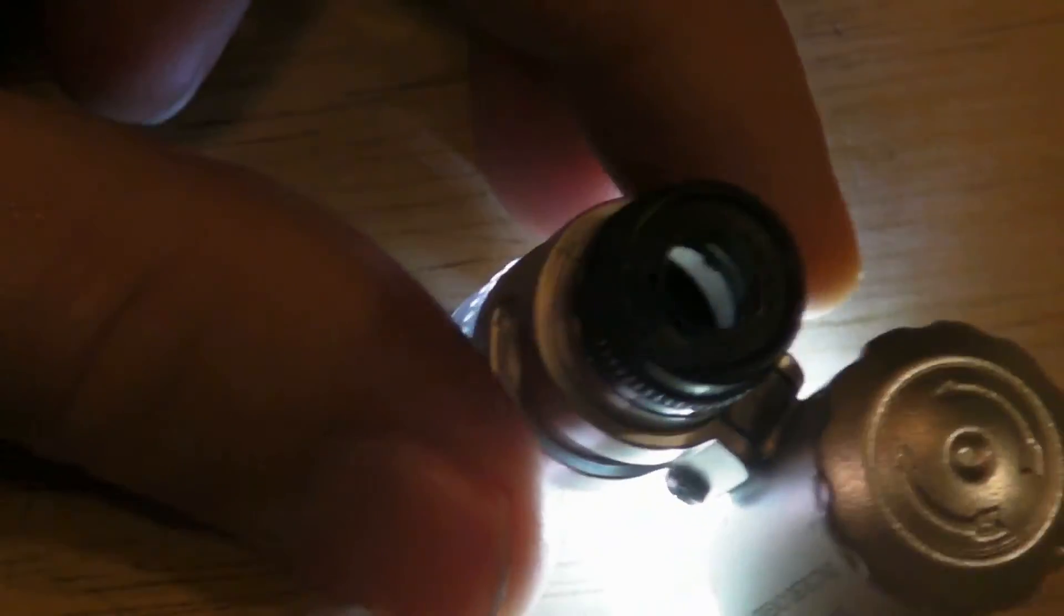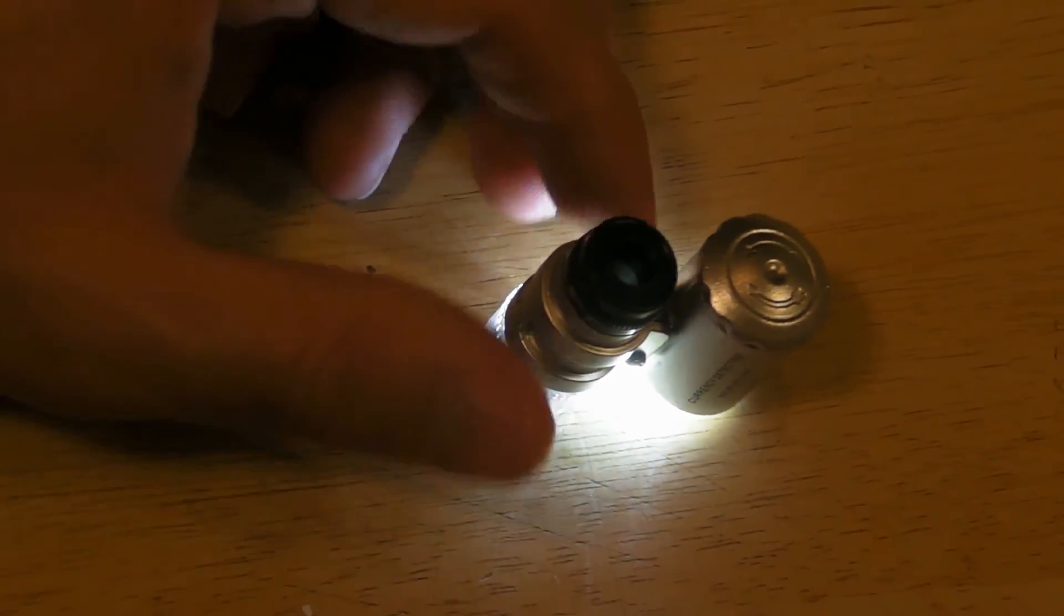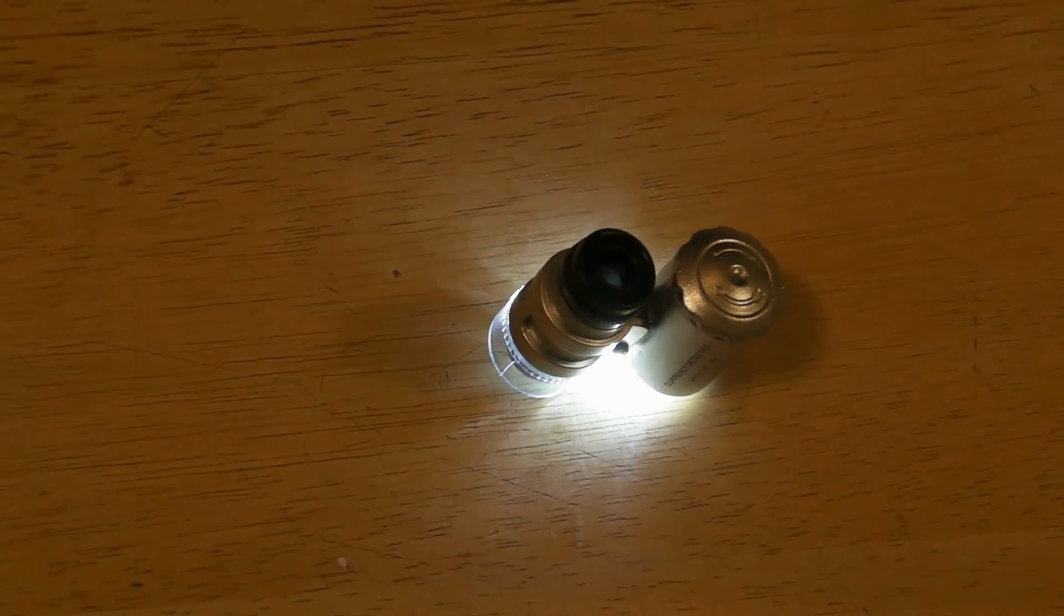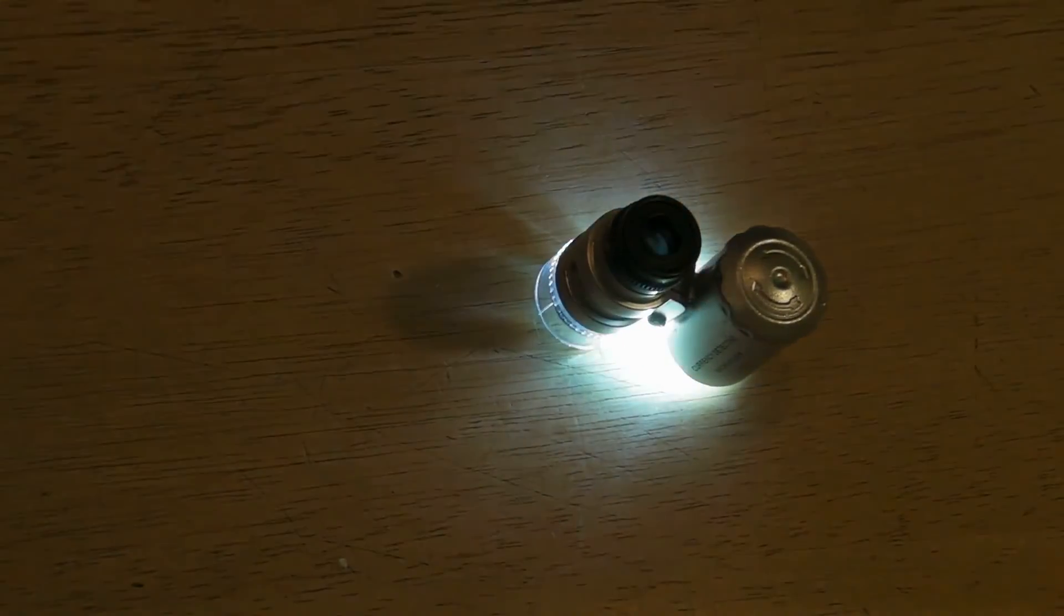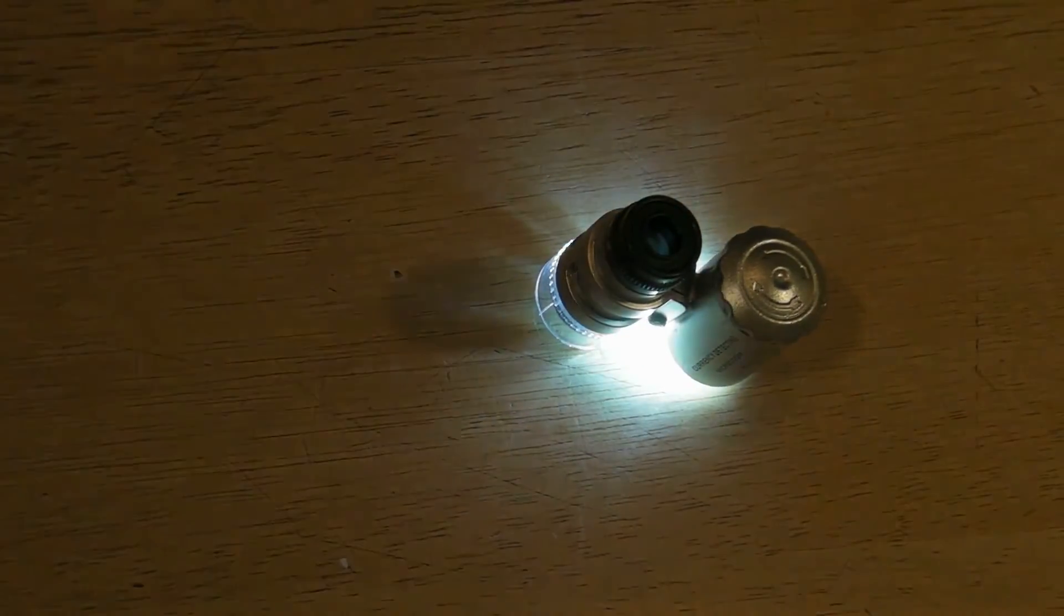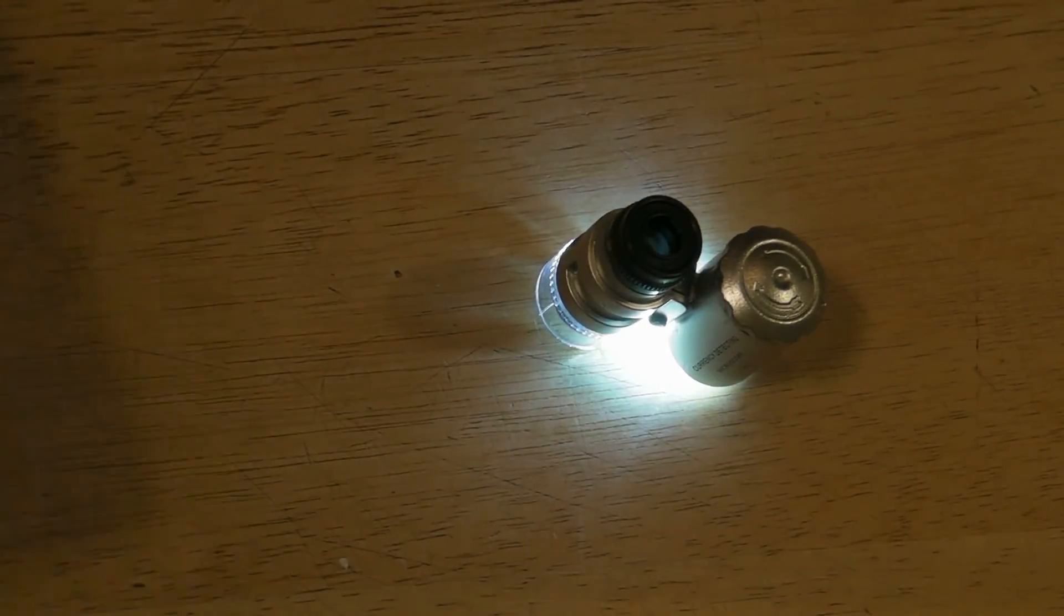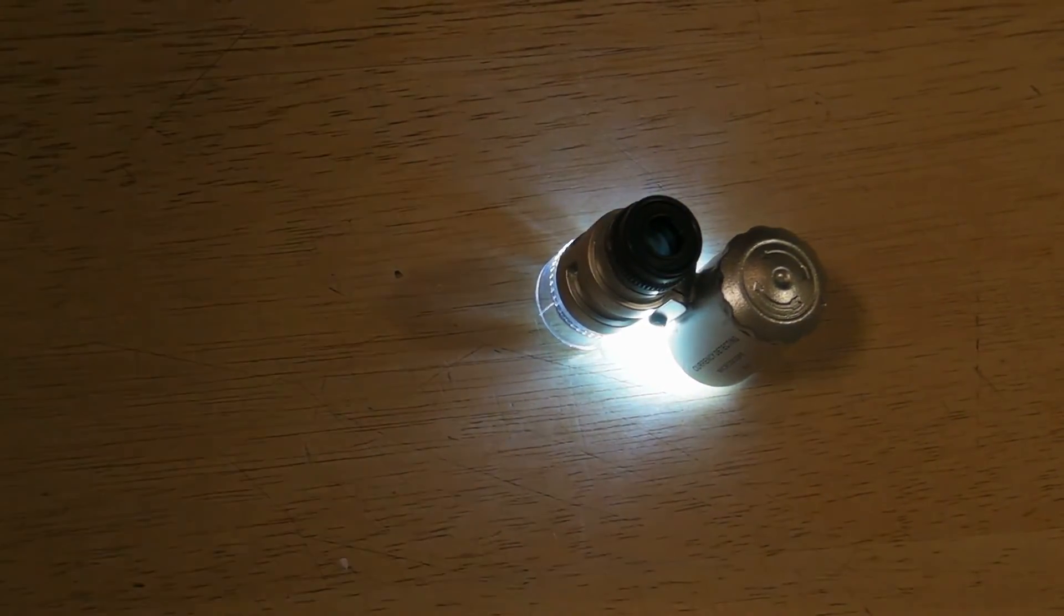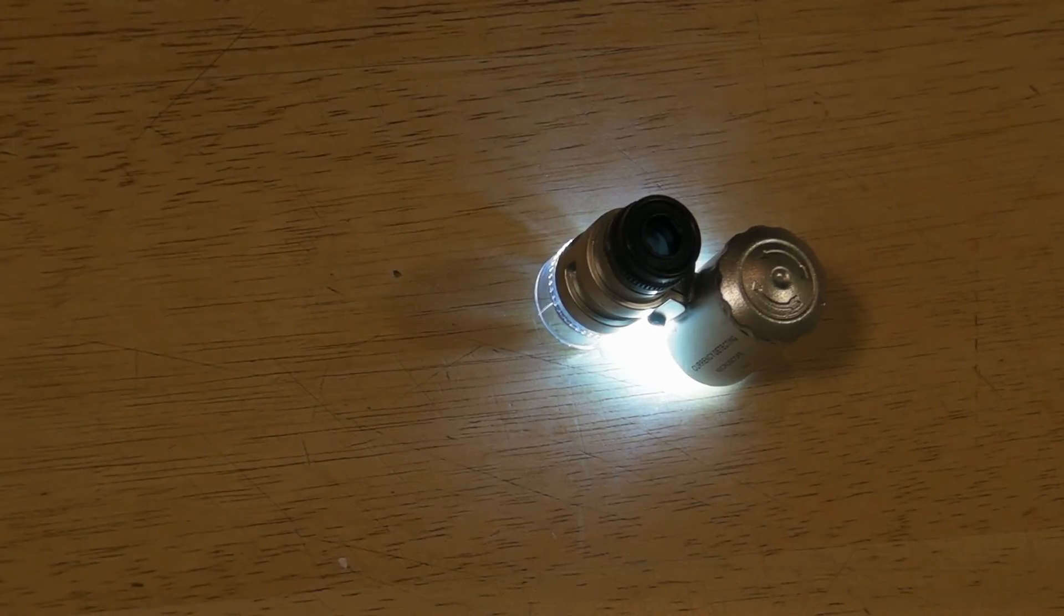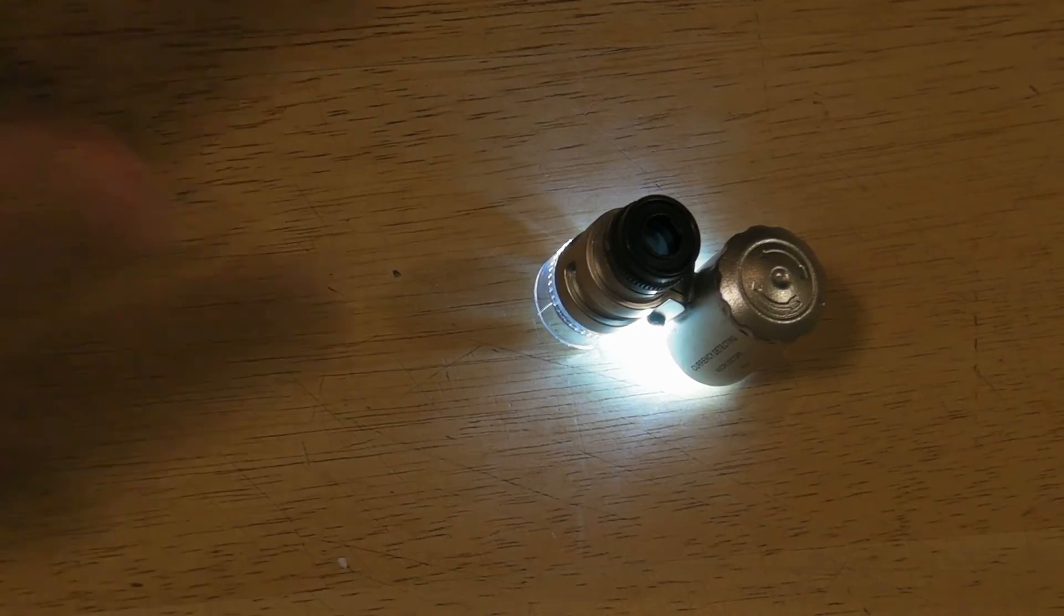It's kind of blurry but you can see kind of the dots of the ink. So it does exactly what you know it claimed. The manufacturer claimed. I mean this is, it's ridiculously cheap. If you search Amazon there's some amazing deals on there.